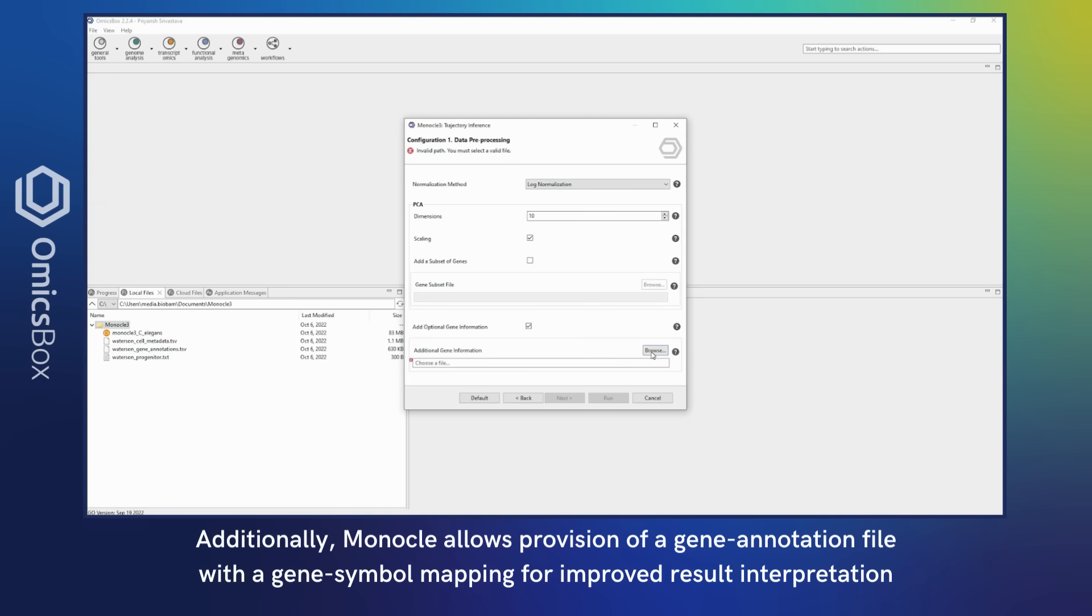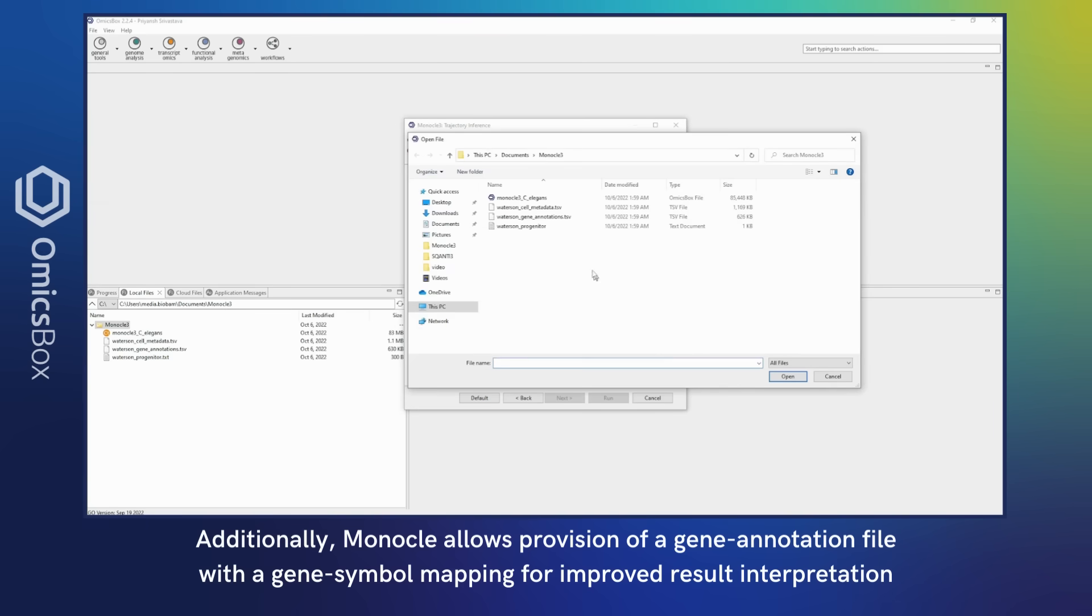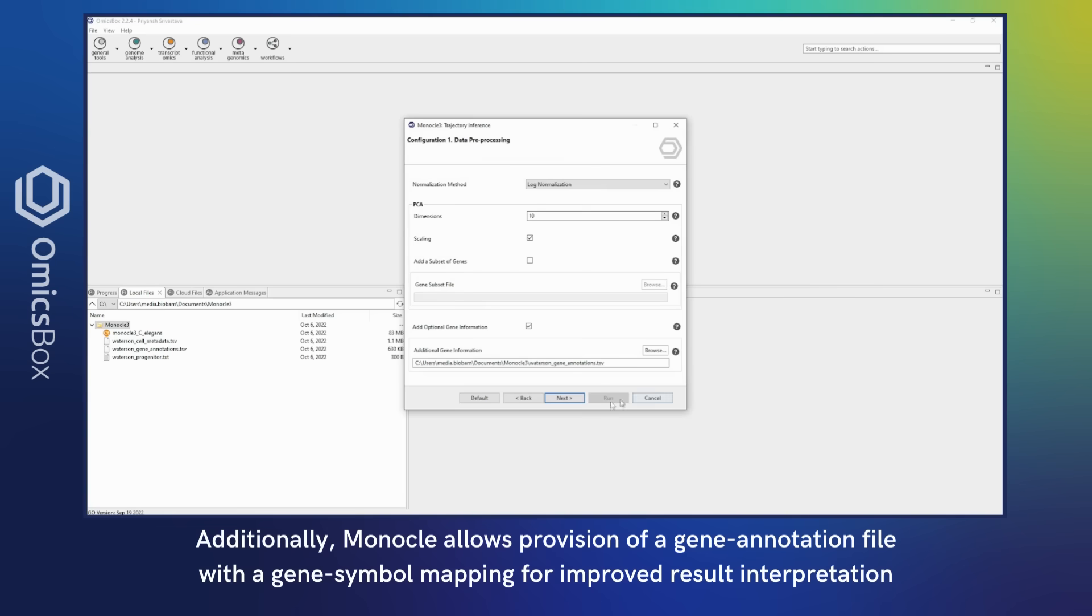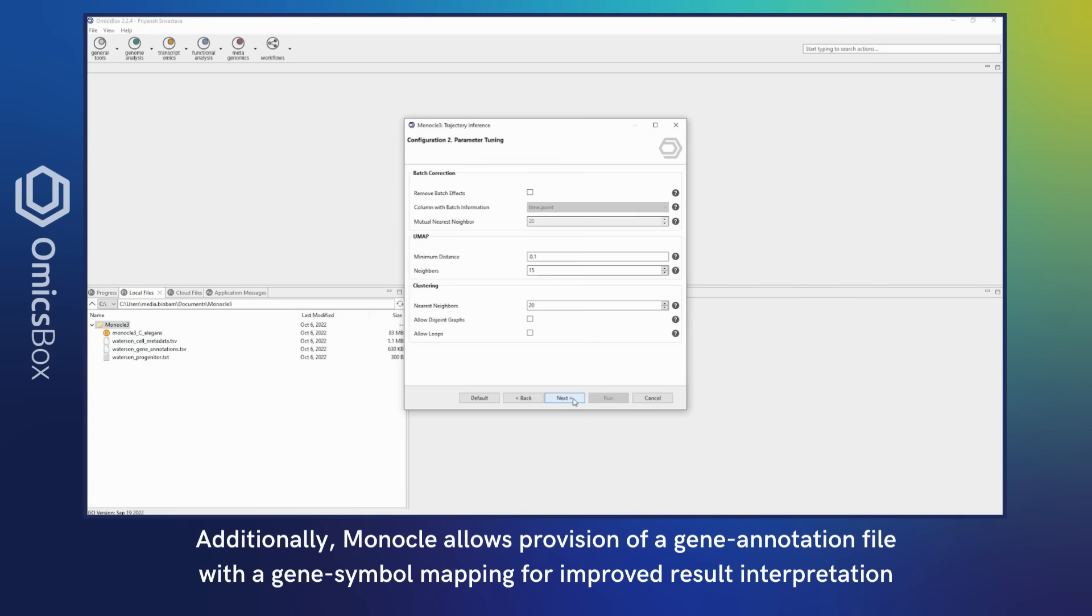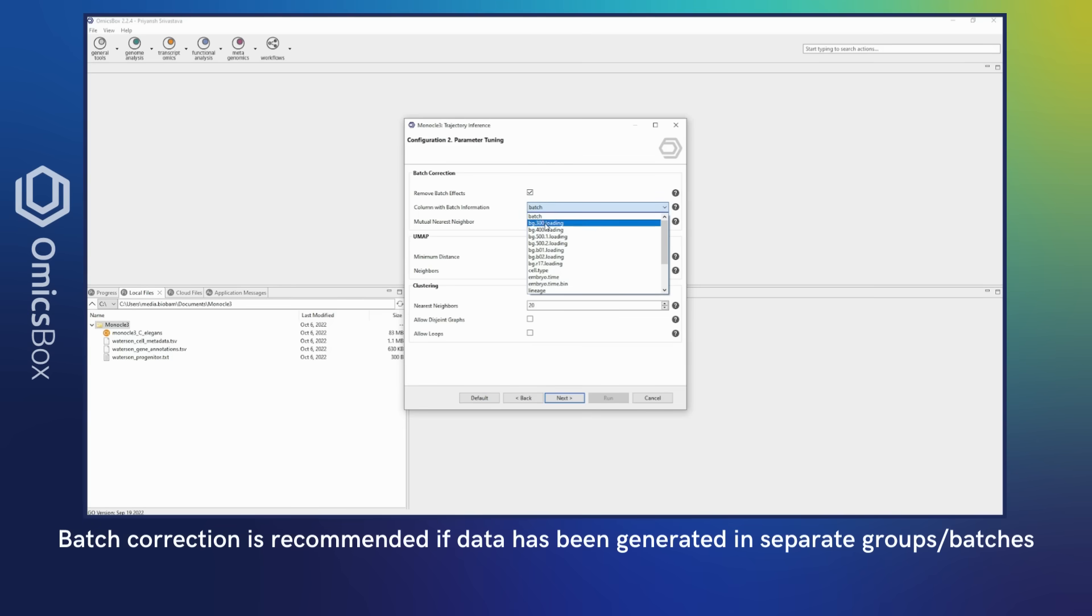Additionally, Monocle allows provision of a gene annotation file with a gene symbol mapping for improved result interpretation. Batch correction is recommended if data has been generated in separate groups or batches.